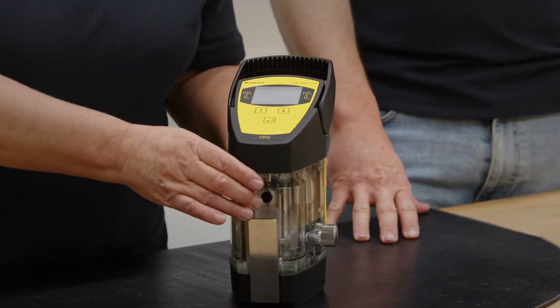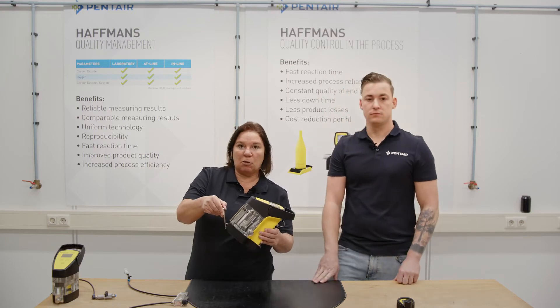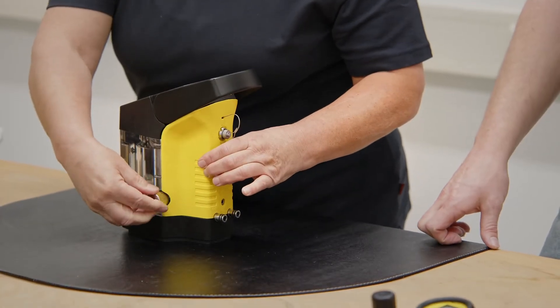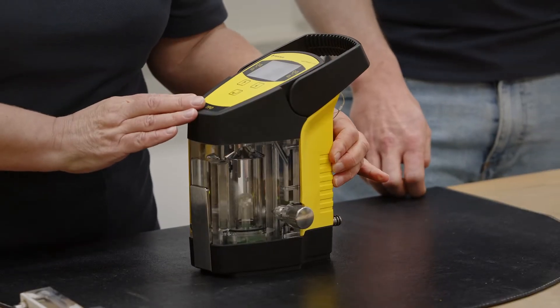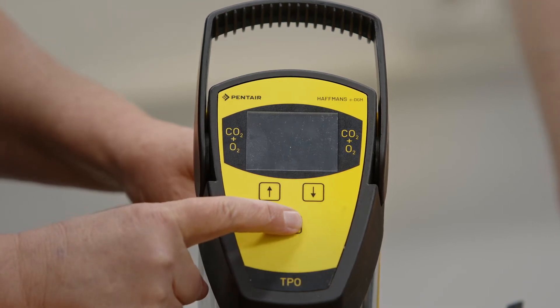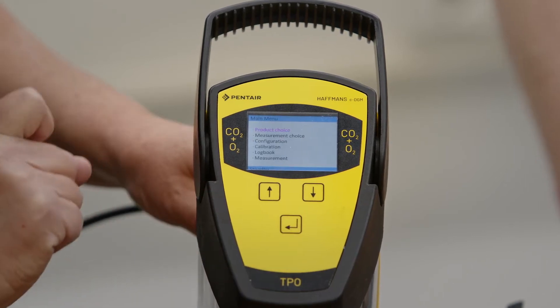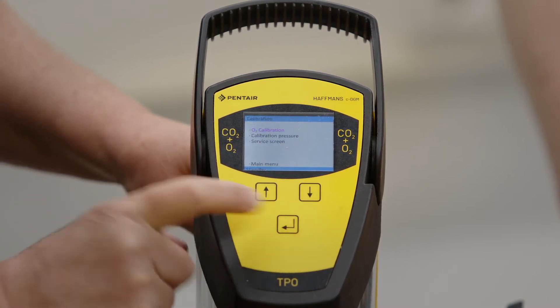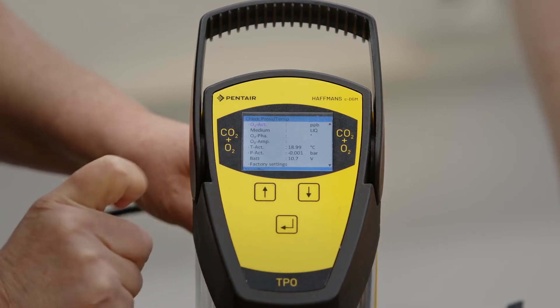Often the meter is filled with liquid or water, so we need to empty the meter first. Open the throttle valve — just open enough to avoid gas pressure building up in the meter. Then we switch on the meter by pressing the enter key for three seconds, and enter once again to get access into the main menu. Then we navigate to the calibration menu and further on to the server screen where we can read the actual values.